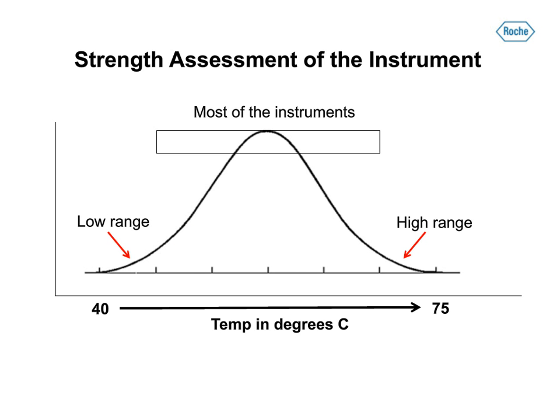So we have designed an experiment in such a way that we did have some data generated by experiments that were created by us. We would be looking at the protein melt behavior somewhere around 75, and then also around 40 and between 40 and 50. And we wanted to do a correlation plot and see how the 480, which we know does a really good job with the protein melt, would reflect in the 1536 data as well.